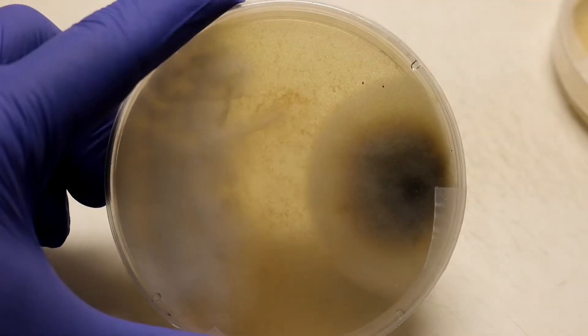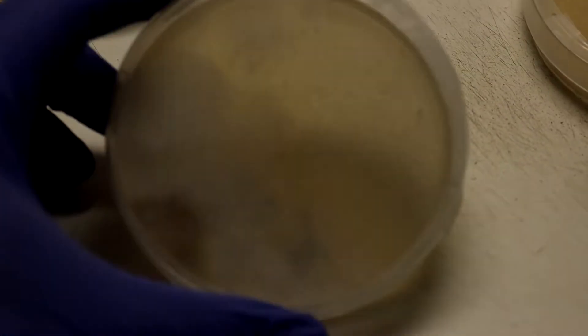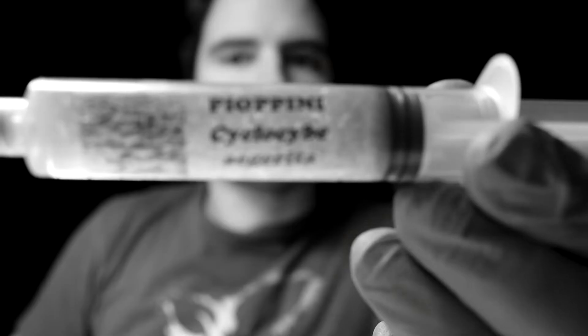Right now I'm working with plates from the 3rd of November, so that's nine days ago. They've had plenty of time to grow and as you can see there's a lot of contamination, and that's what we expected. I took the swab, I swabbed my mouth, then I used the liquid cultures and I streaked them out.